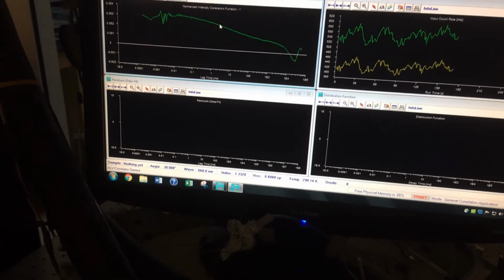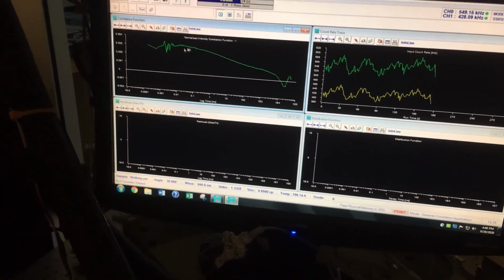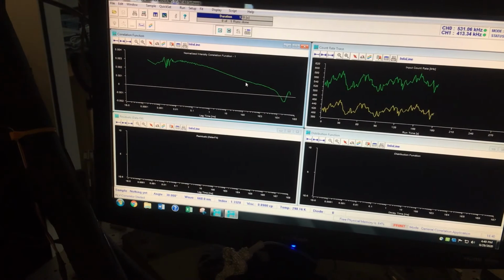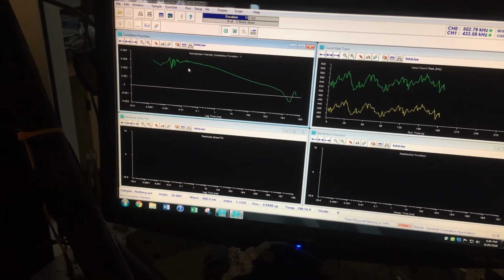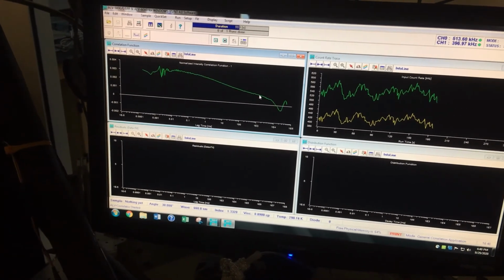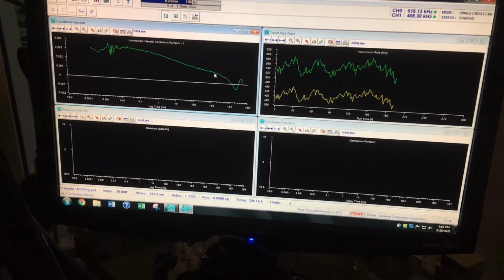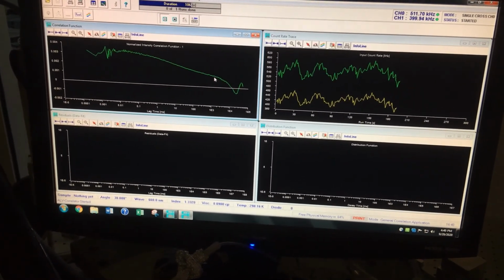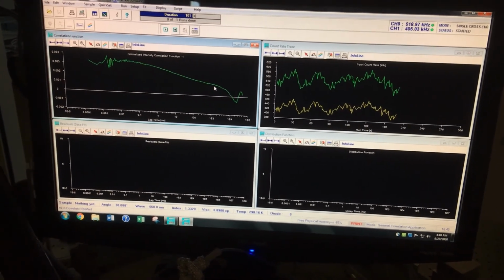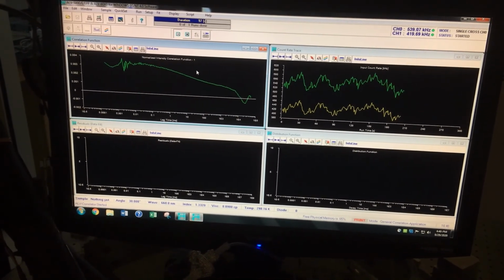And anybody who, like I say, who's looked at a lot of these would say, oh my goodness, this is containing a lot of different sizes. And the depolarized dynamic light scattering experiment is very sensitive to size distributions. So this might be a pretty good way in a biorefinery or some similar type operation to characterize the quality of the product. Okay, that's all we'll say about this for now.